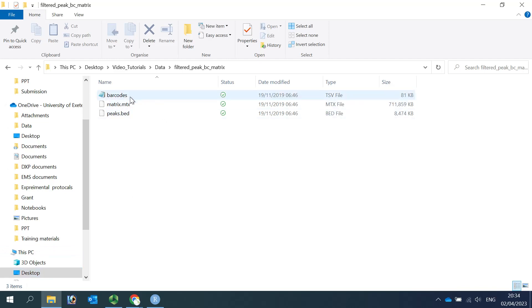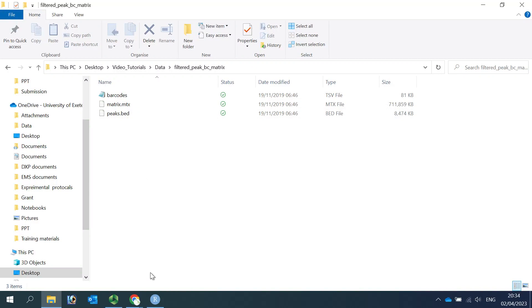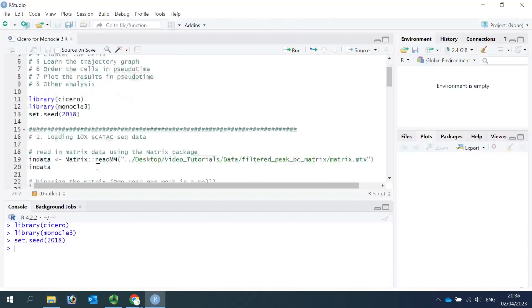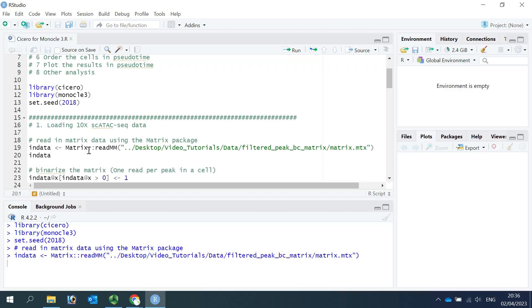One file is the barcode, the other one is the matrix data, and the third one is the peaks bed file. Now we can load the data into R. We can use the readMM function from the Matrix package to read the matrix data into R, and we name it as INDATA. I'm using the same code from the online tutorial.